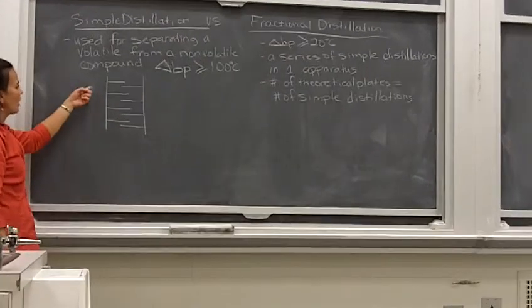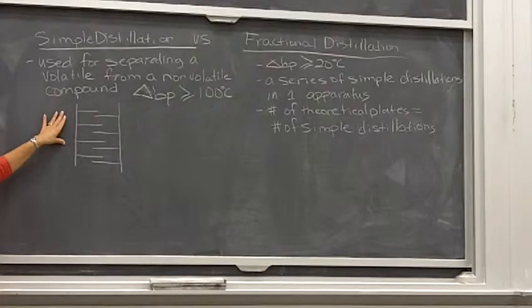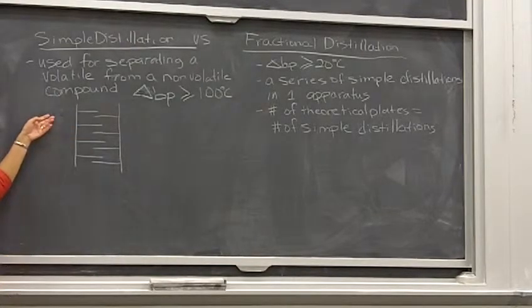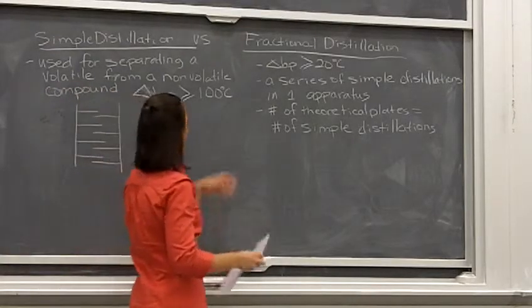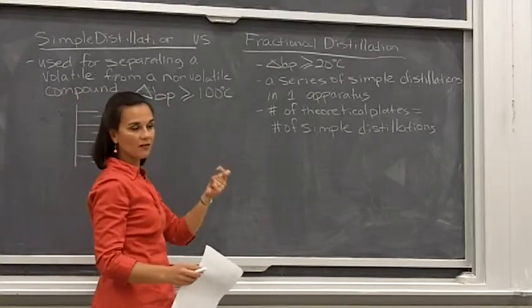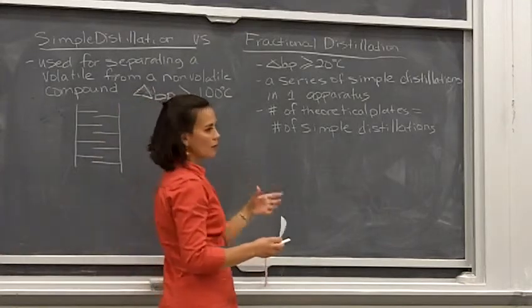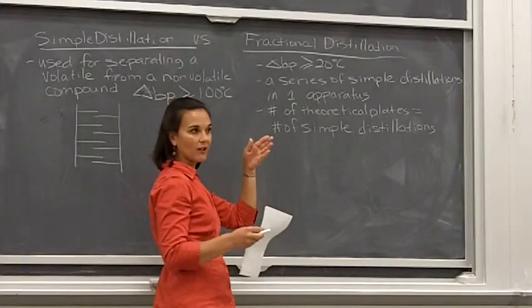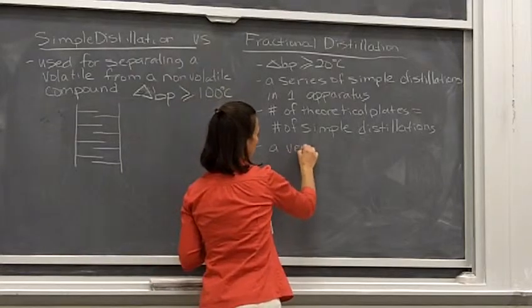And so today, in a regular lab setting, columns like this aren't used so much, but in industry, this is still used if a fractional distillation is needed. They make a large column with all these plates in there for the fractional distillation, okay? And so before, when we were taking off the ether, taking out the hexane, we were doing one simple distillation. That was it. If you, to your simple distillation apparatus, were to just add a vertical column, so not any packing or anything, just add a vertical condenser, that will add about 2 to 3 theoretical plates.